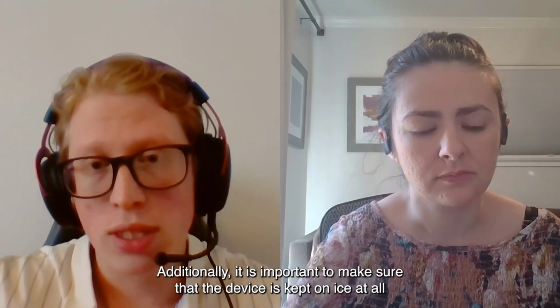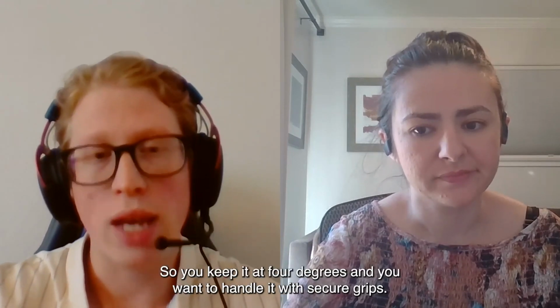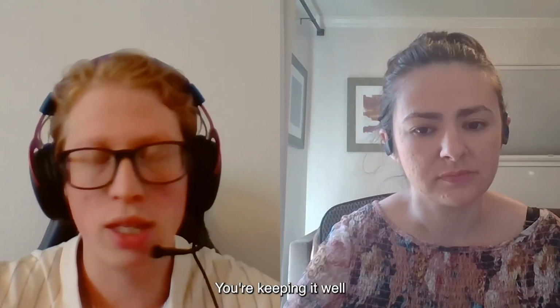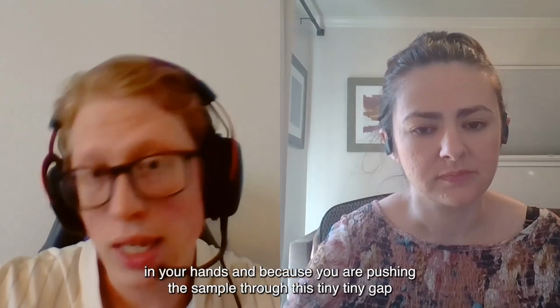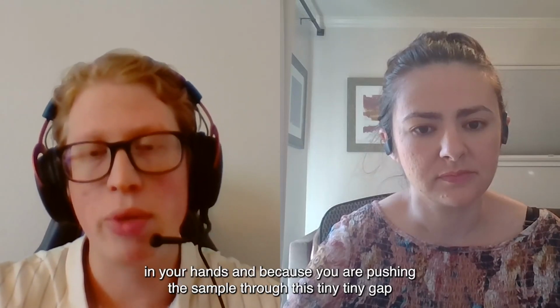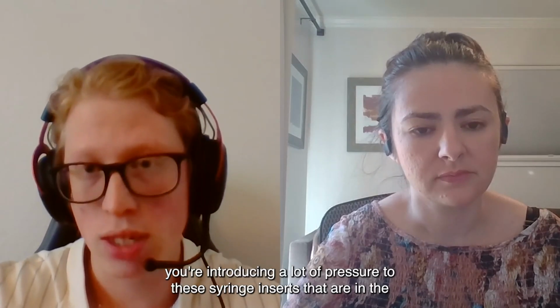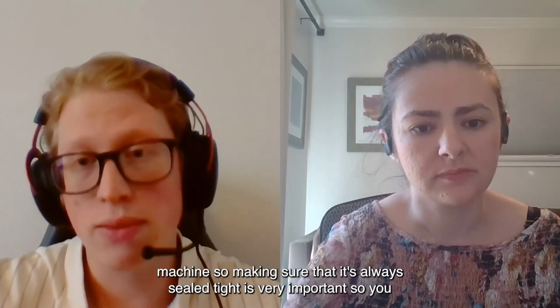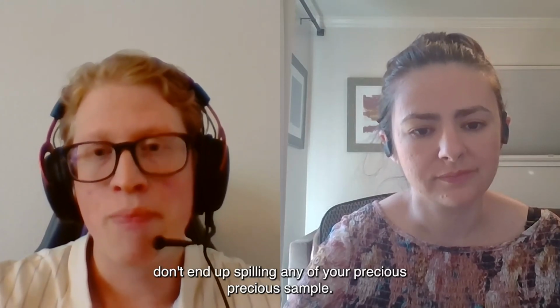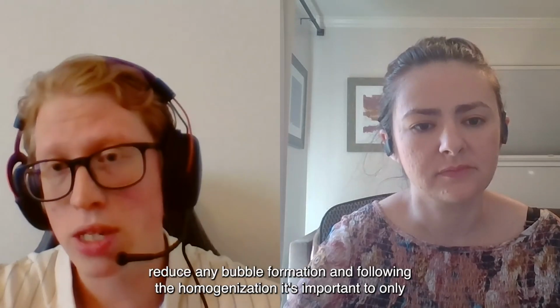Additionally, it is important to make sure that the device is kept on ice at all times, so you keep it at 4 degrees, and you want to handle it with secure grips, so you want to make sure it's securely on ice, you're keeping it in your hands, and because you are pushing the sample through this tiny, tiny gap, you're introducing a lot of pressure to these syringe inserts that are in the machine. So making sure that it's always sealed tight is very important so you don't end up spilling any of your precious, precious sample. Keeping a constant pressure as well while you're homogenizing is very important to reduce any bubble formation.